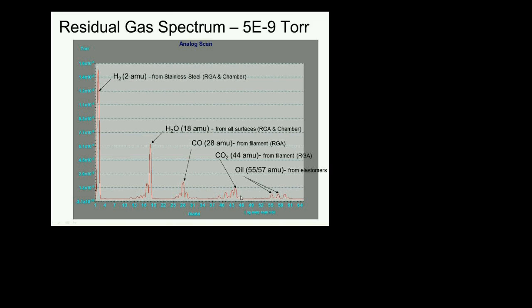And you can see here what I was talking about before. If you look at the CO2 peak, there is a peak before it at 43 AMU, and so this is kind of like a cluster. And then there is another cluster at 55, starting at 55, 57 right there. That is the 14 AMU increase relative to the 43. These are little clusters of hydrocarbons at 14 AMU increments, and you will see them in vacuum systems that are contaminated with hydrocarbons.